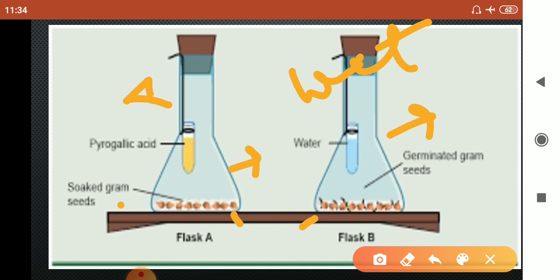We will hang a small tube in both flasks. We will put alkaline pyrogallic acid in one tube and plain water in the other tube.